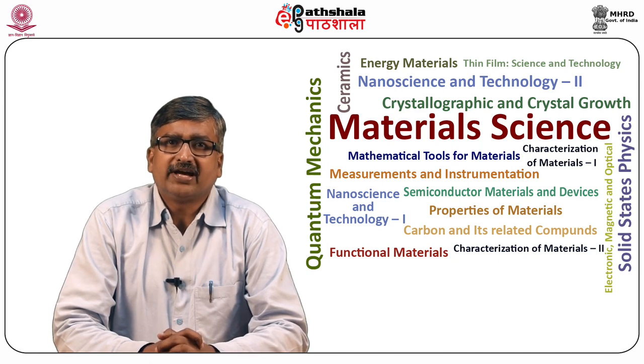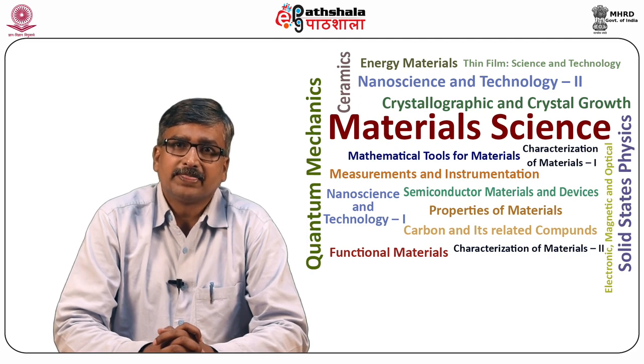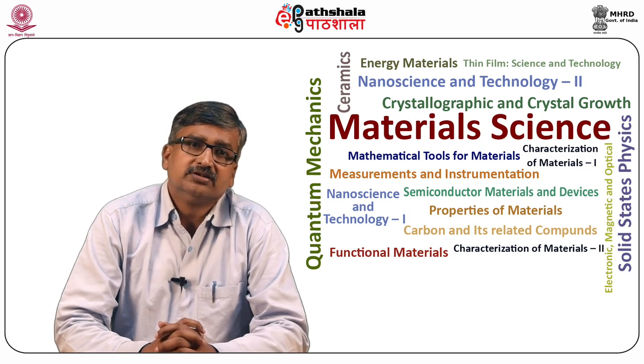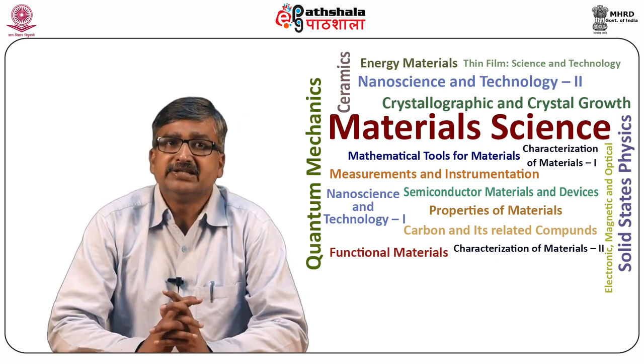Electron microscopy has revolutionized our understanding of materials by their structure properties correlation down to atomistic level. It is now even possible to tailor the microstructure of material to achieve a specific set of properties. The extraordinary ability of modern transmission electron microscope is to provide almost all the structural, phase, and crystallographic data.